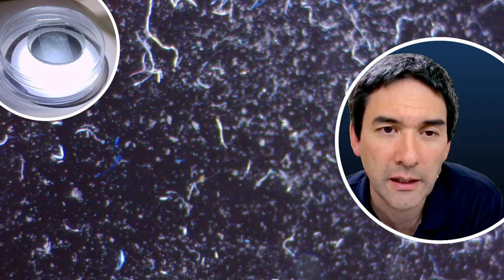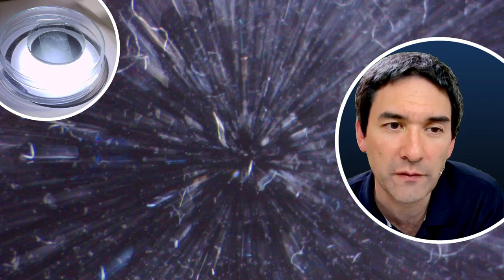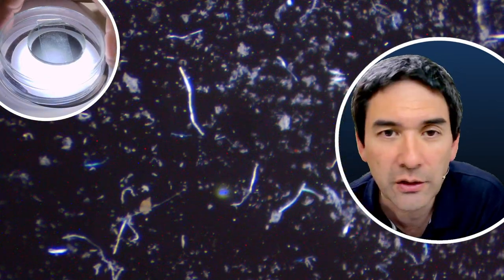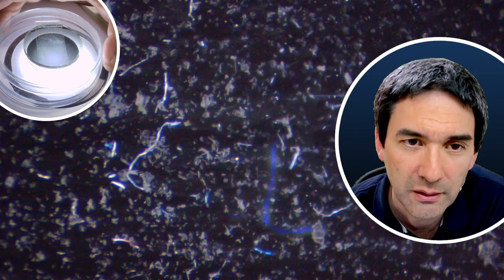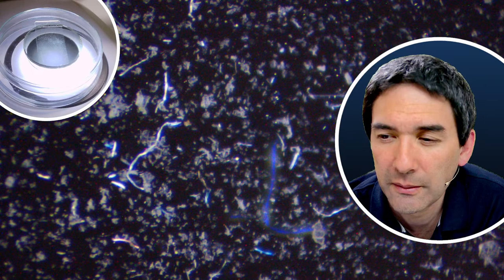And why I like to observe dust under the microscope is because you can occasionally find some interesting things. You can not only find the different textile fibers, but occasionally you're also able to find scales of butterflies and other interesting things as well. But those fibers, synthetic fibers, are actually very prominent. Okay. So for example, the blue fibers that you see over here.